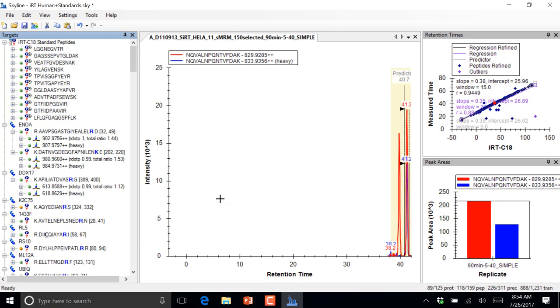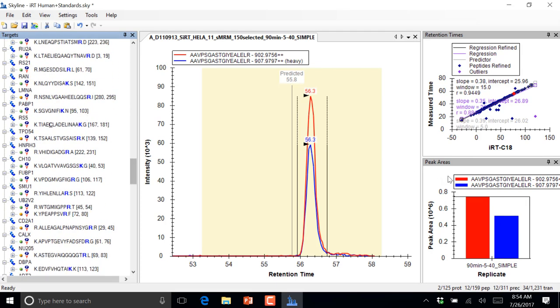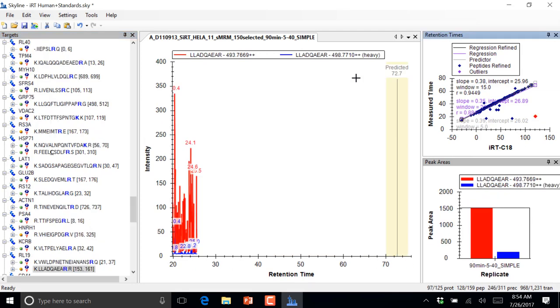Wow. Okay. Not sure what was going on there. So now I think hopefully, yeah, it's showing me. So if I've got it both, then I can see both the picked peak and the best peak in the prediction. And most of the time they're going to be really close. But in this case, yeah.